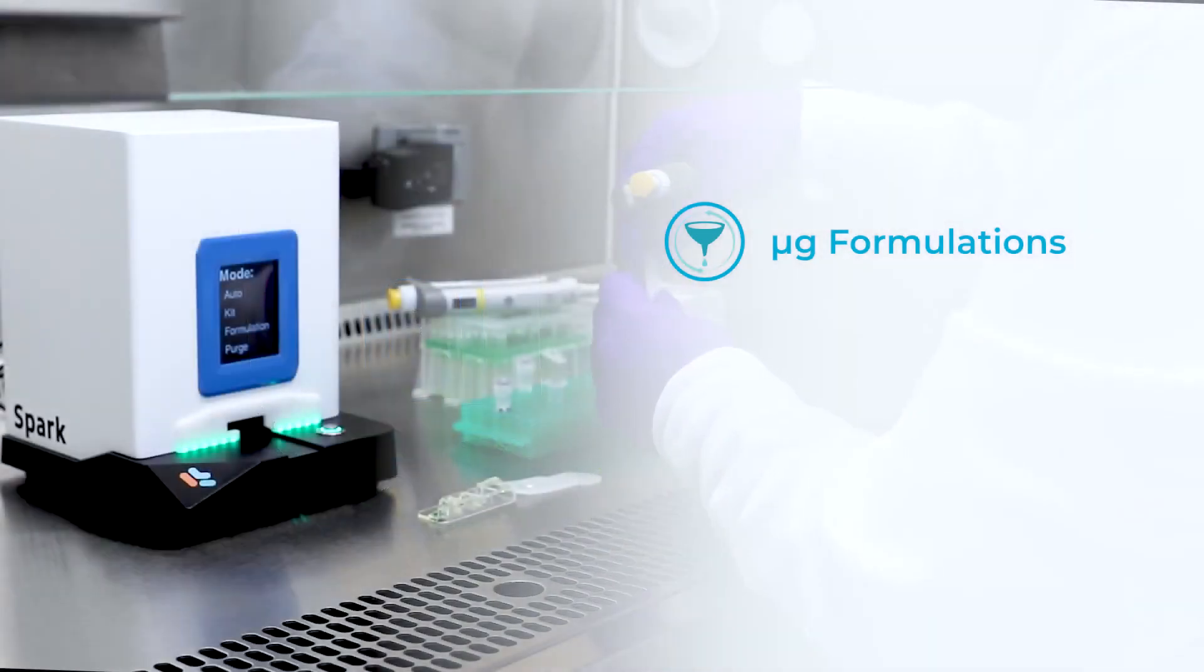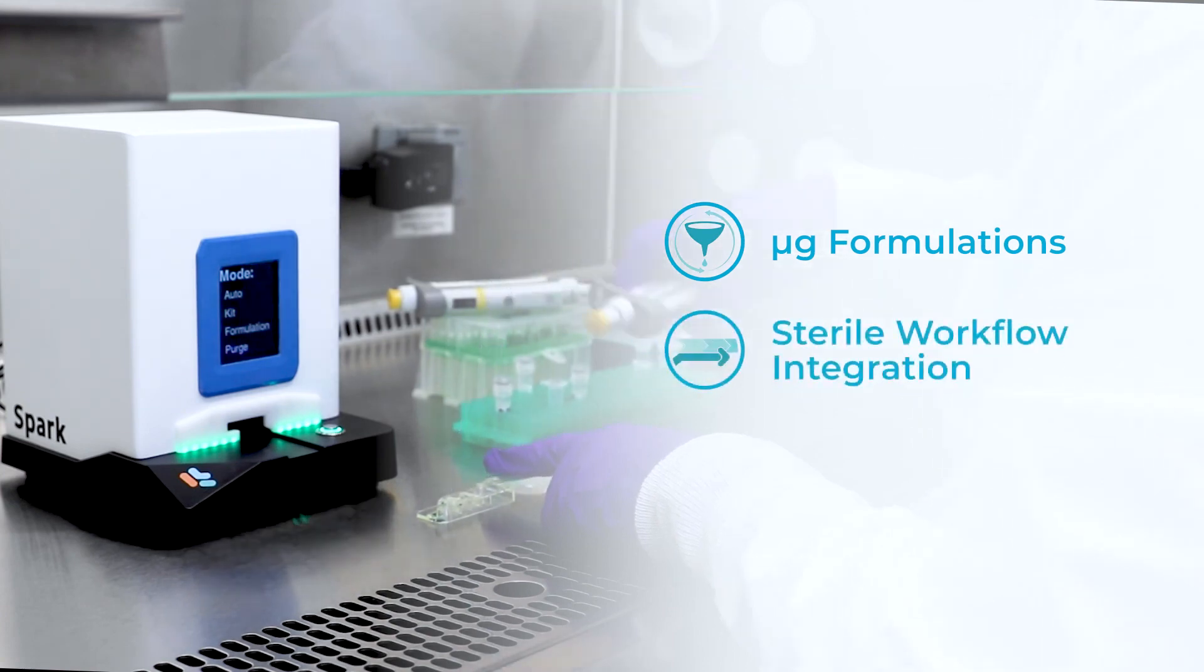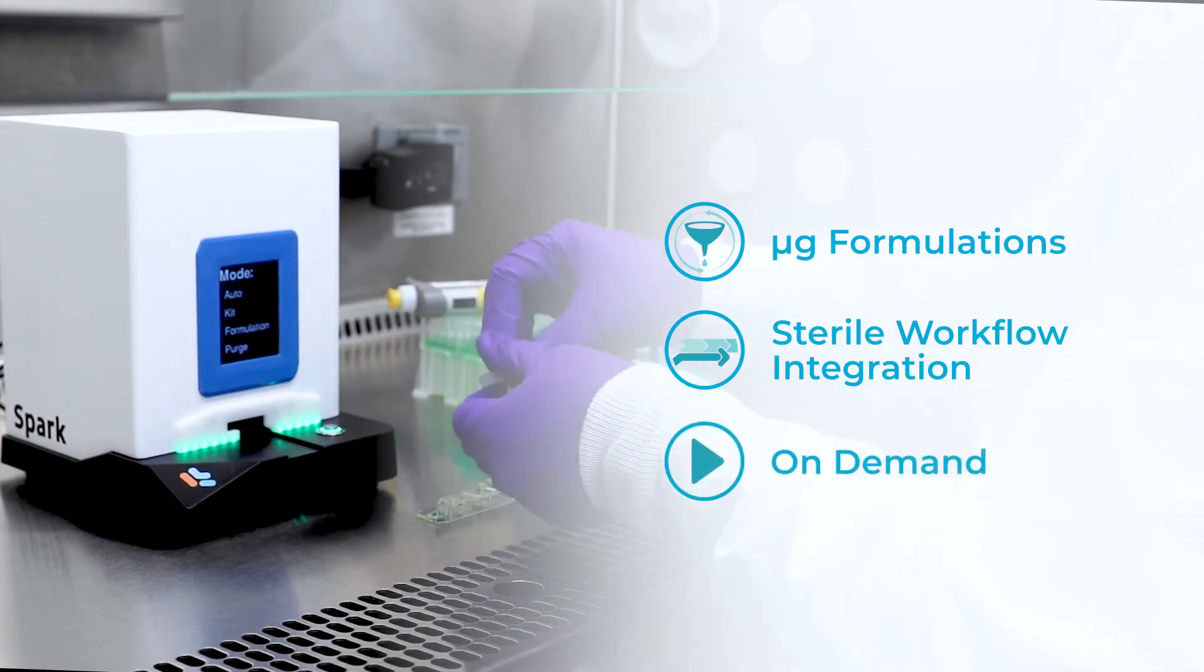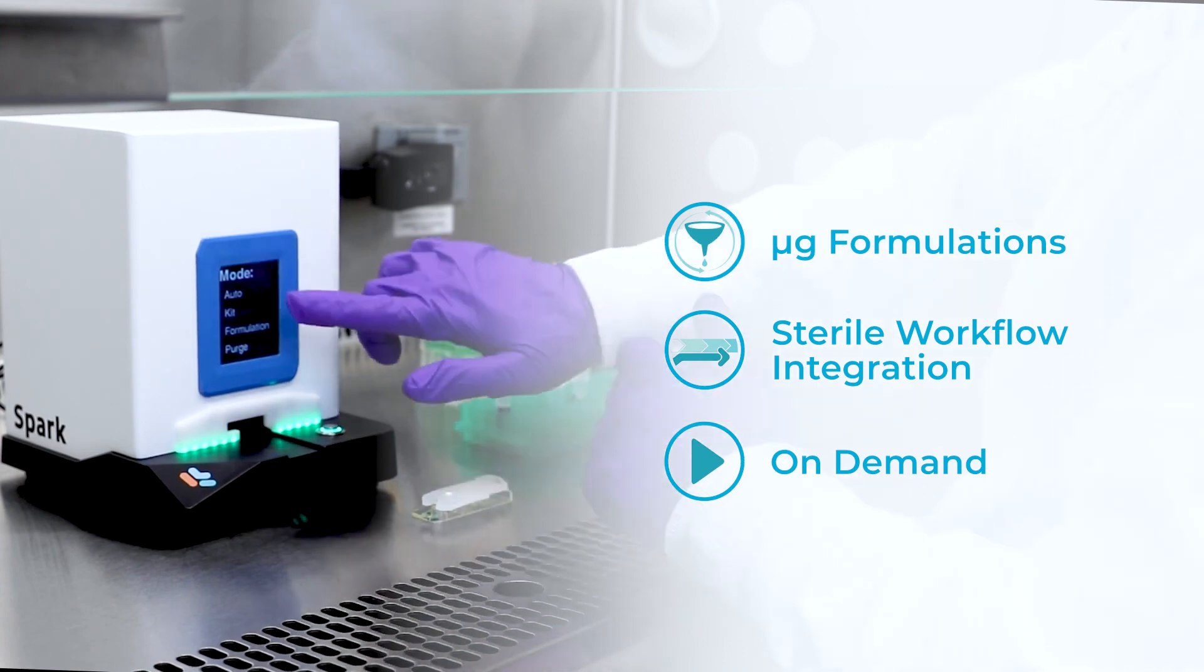The NanoAssembler Spark is specifically designed for in vitro and ex vivo screening. With simple operation and gamma irradiated cartridges, Spark integrates seamlessly into a sterile cell culture workflow, empowering on-demand formulations to accelerate discovery and early preclinical development of RNA lipid nanoparticles.